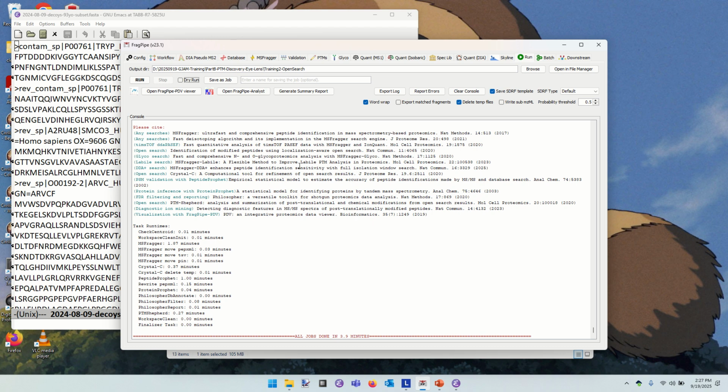If you see a gain of 22 on a peptide, that's sodium. You have a little bit of sodium in your sample, and plus 22, or is it plus 20, plus 23? Oh my goodness, I should have this up. Oh, we're okay. It's Friday afternoon. It's setting, and I'm afraid. So I'm going to pull this one.